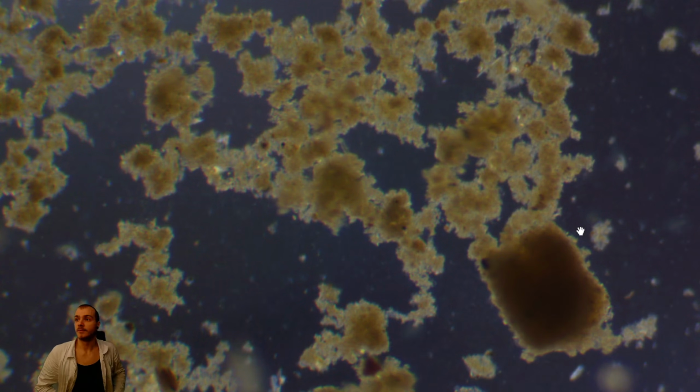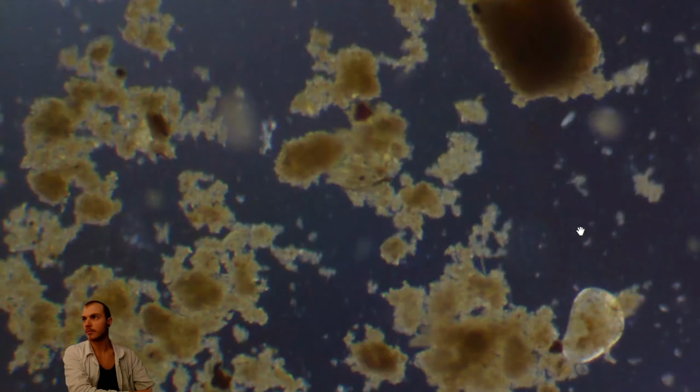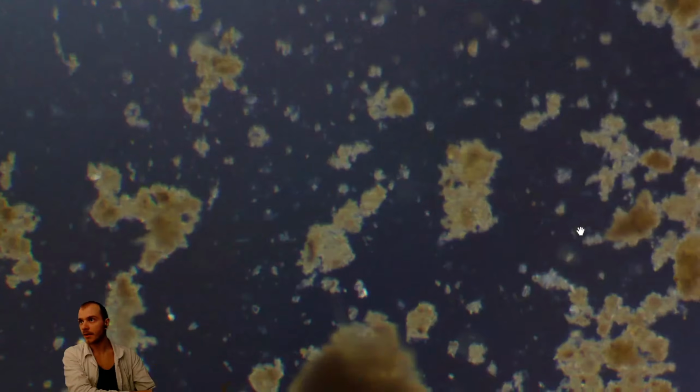And yeah, this is a sample from the aquarium, but I didn't take any ostracod here. This looks like some sort of bacteria colony, probably cyanobacteria, but I'm not sure.